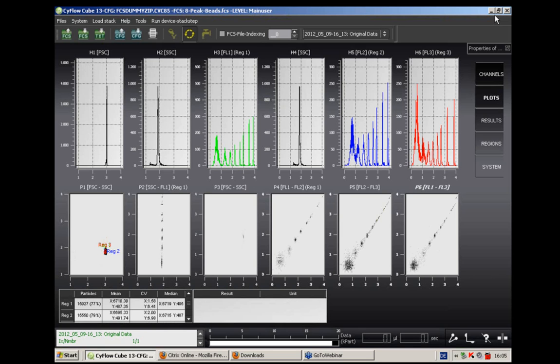And this is the first time that we are organizing such a webinar for our Cube instrument users, because we think it's extremely useful for those of you working with FCS Express to get an introduction to the software, which is extremely powerful, but also a bit demanding in terms of getting used to the software and to be able to work with it and really make the most out of its high potential. We had those meetings for our Partec internal people quite a few times, and I joined all of those webinar sessions, and it's extremely useful. This is my own experience, and for that reason we decided to make those webinars for all our Partec users.